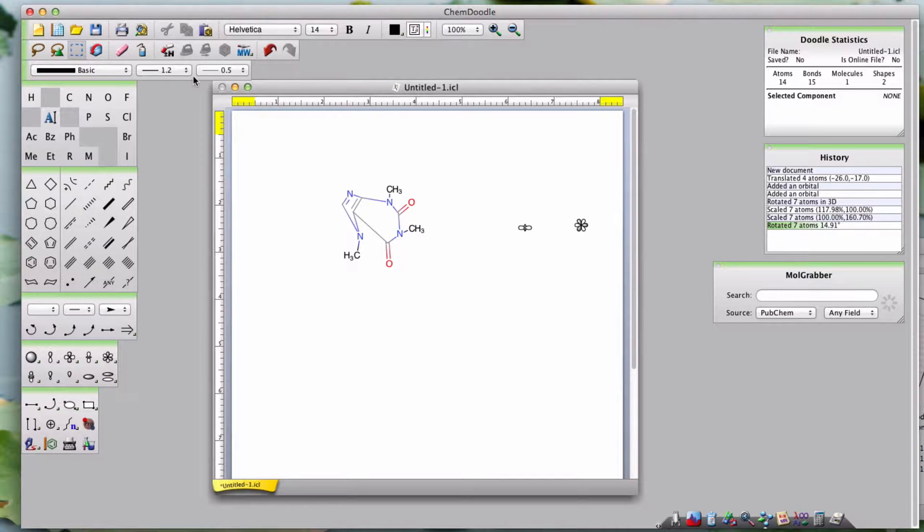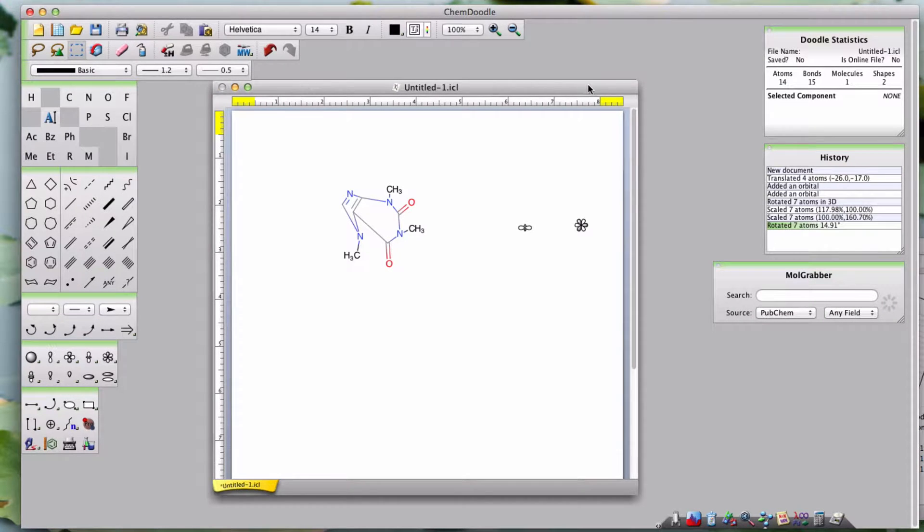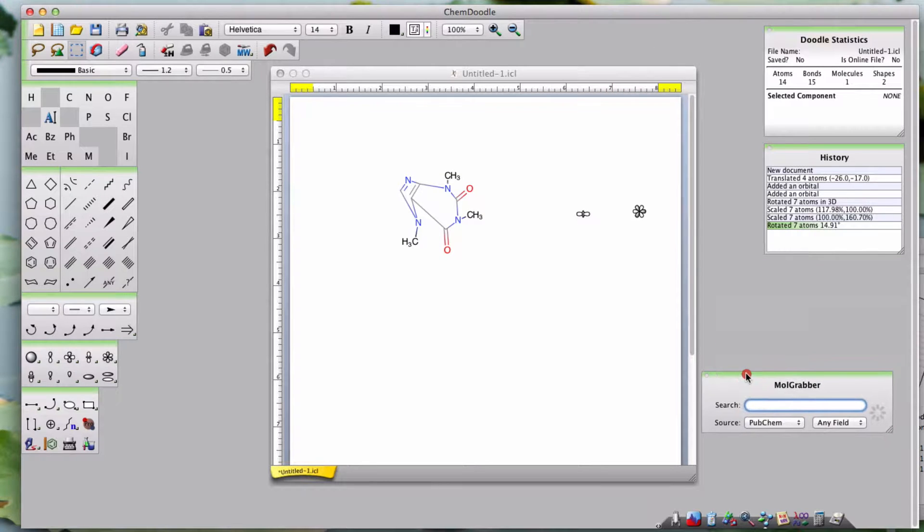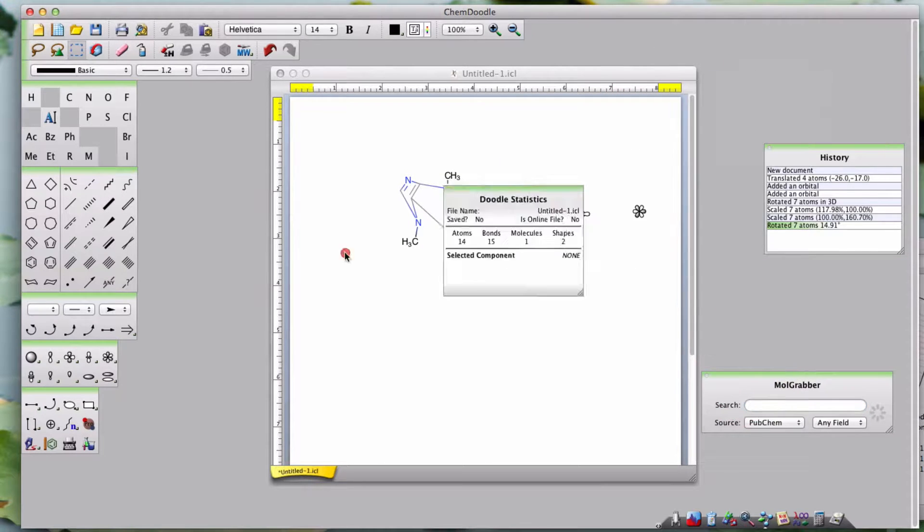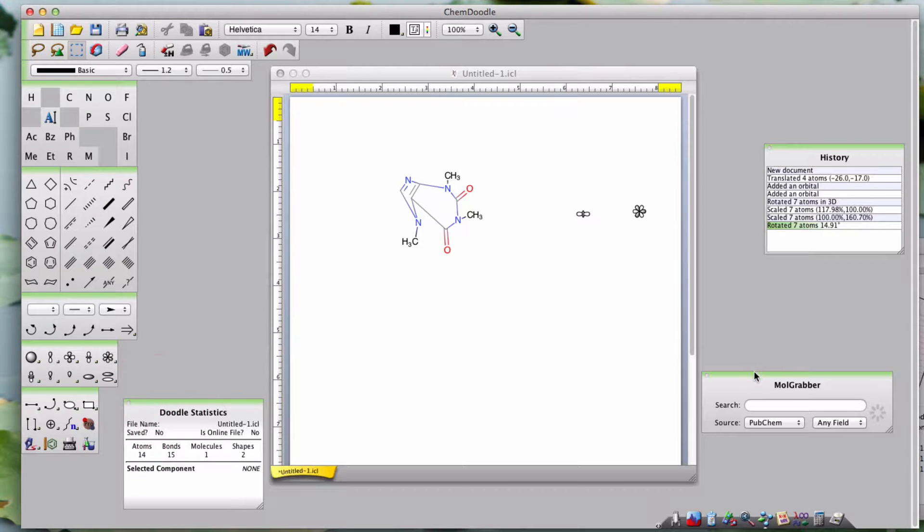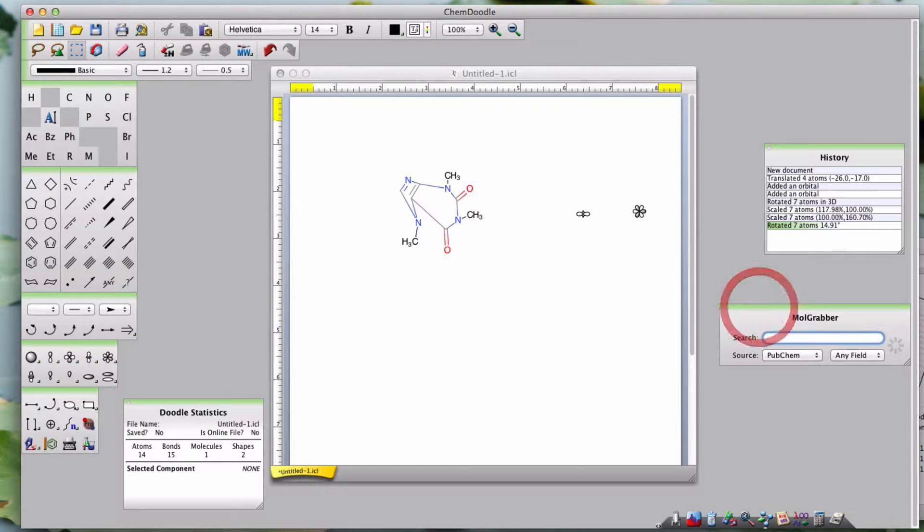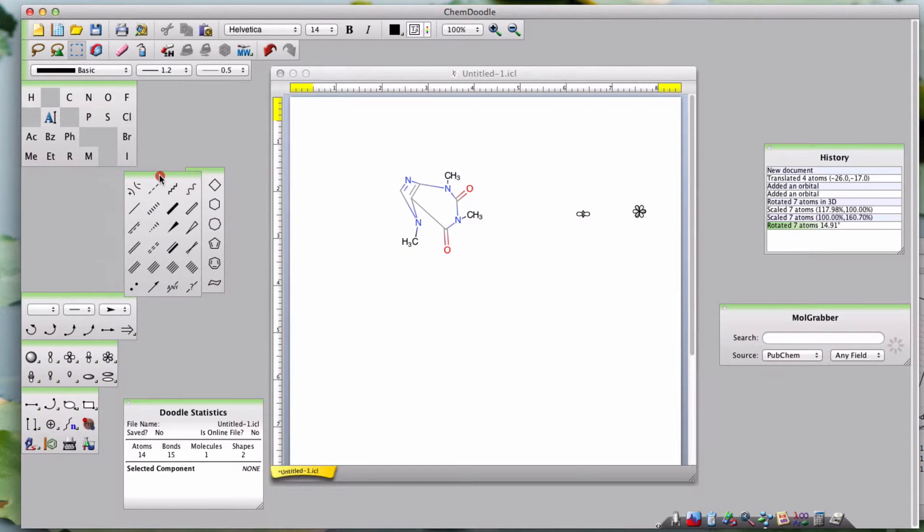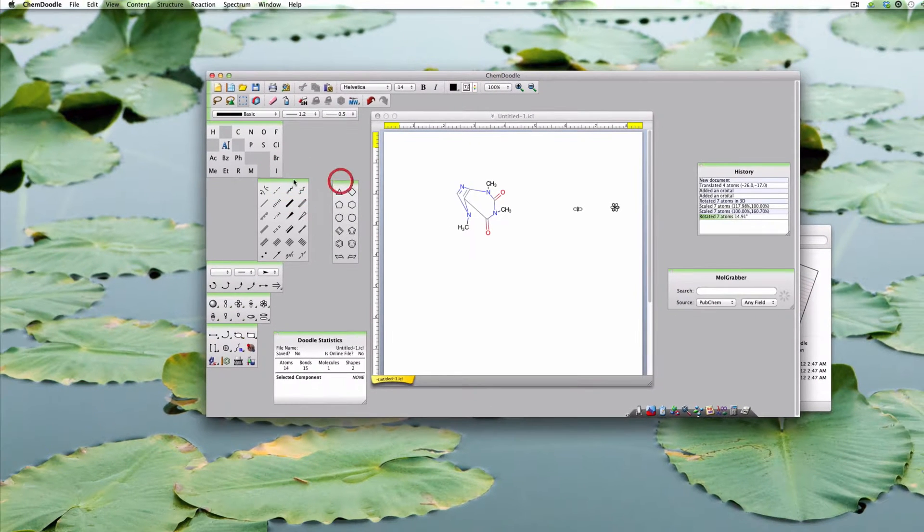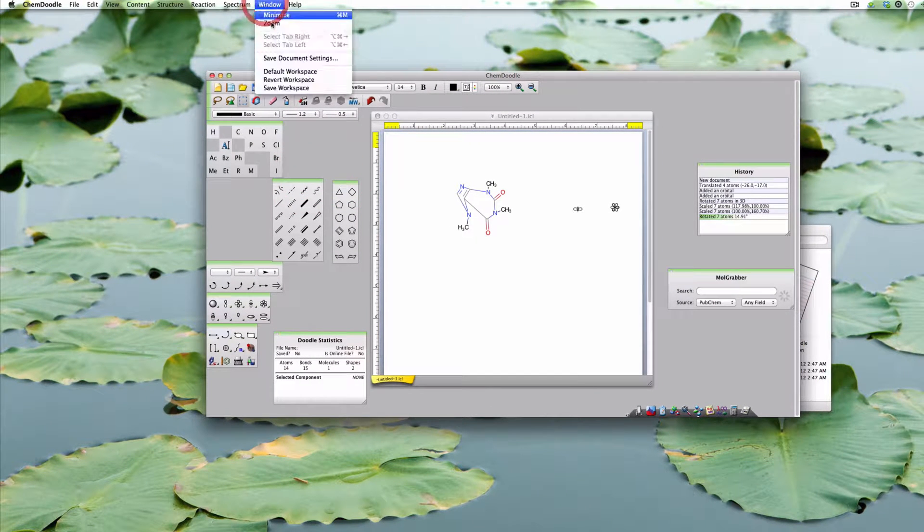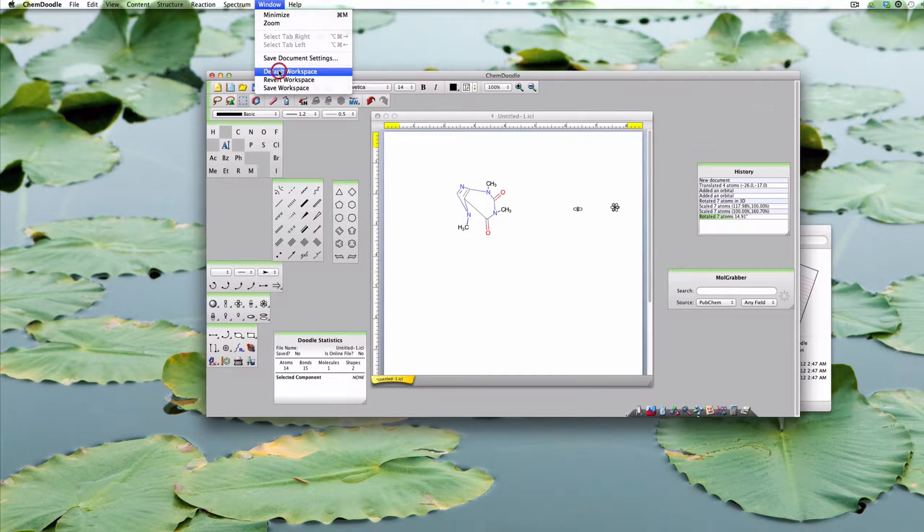The workspace can be rearranged in any manner you please. You can resize the whole area and place the toolbars in various windows, wherever is convenient for you. All changes will remain next time you boot up the program. If you don't like the change, go into Window Default Workspace and you can reset the layout.